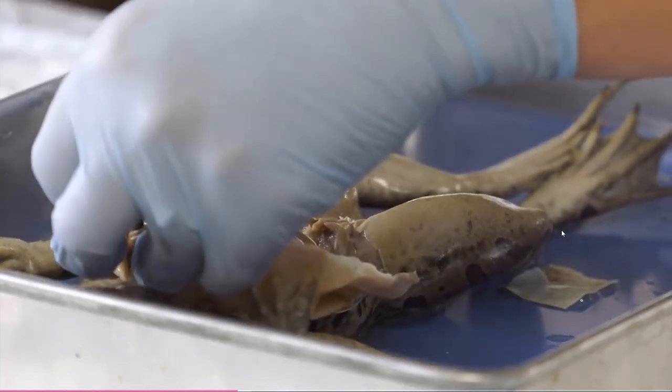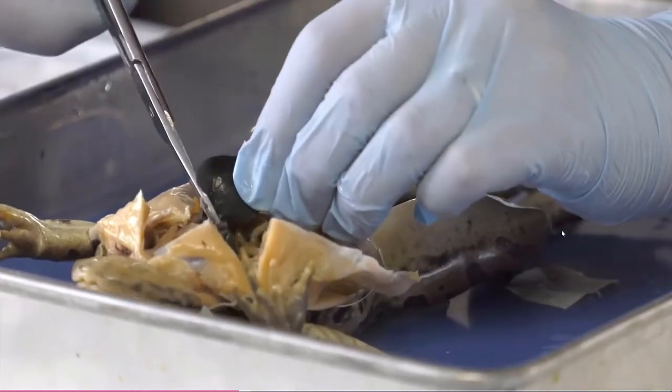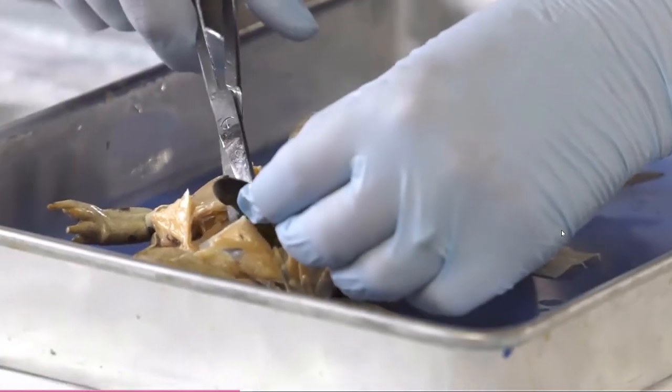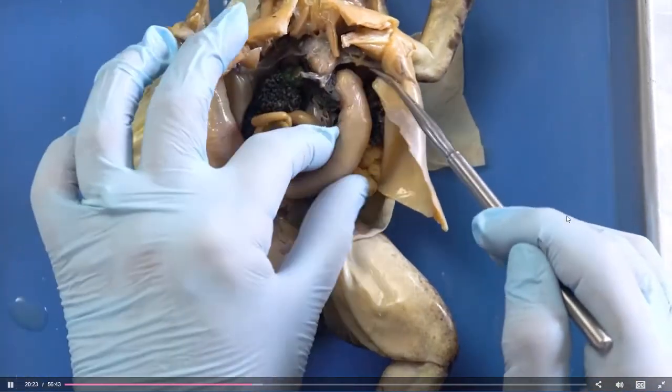On a side note, if you're thinking about really studying the circulatory system of the frog, I would highly suggest that you order an injected frog so that your students can follow the trail of those blood vessels very easily.